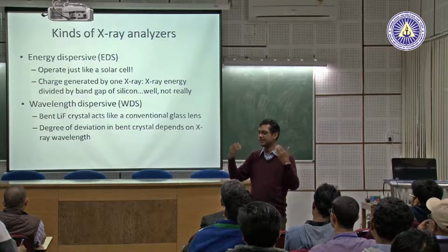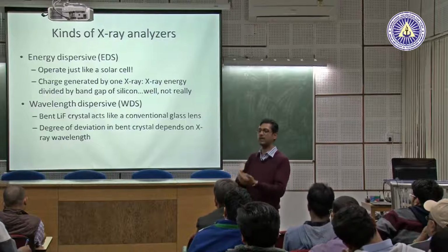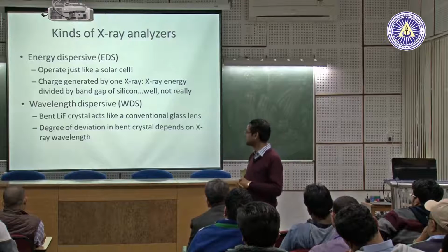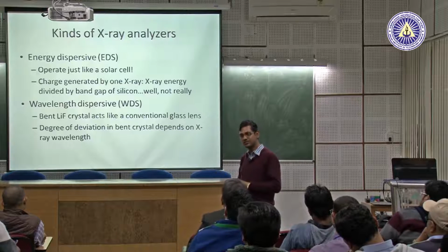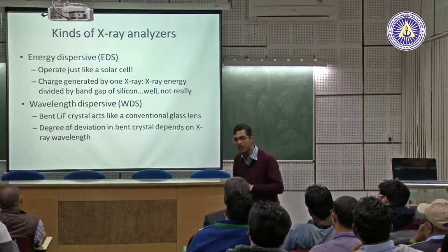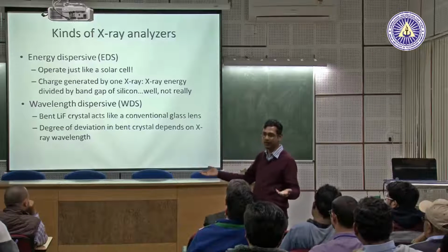Suppose your sample contains 10 elements: oxygen, carbon, aluminum, copper, nickel, barium, titanium, and each will generate X-rays because of the bombardment of electrons. Each one has characteristic wavelengths because of energy. Energies are fixed and related to wavelengths.